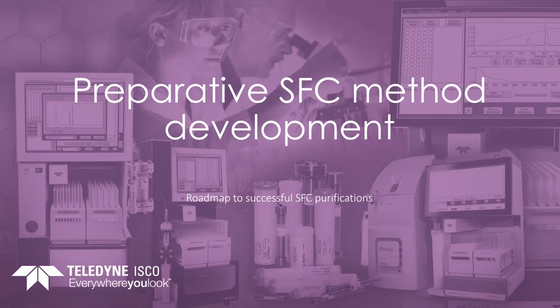Today, we will talk about a new workflow for supercritical fluid chromatography, SFC, which uses the data from column screening to directly create isocratic or focused gradient methods, and we will compare it to existing SFC method development techniques.